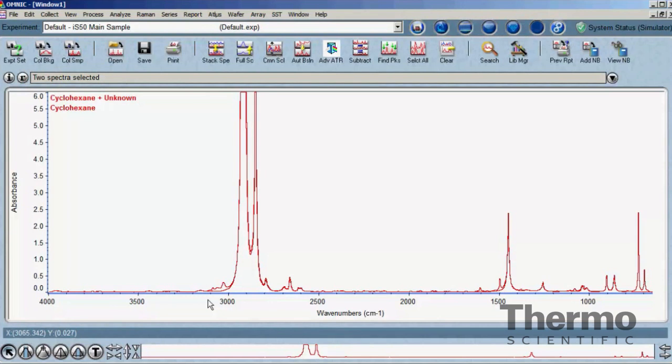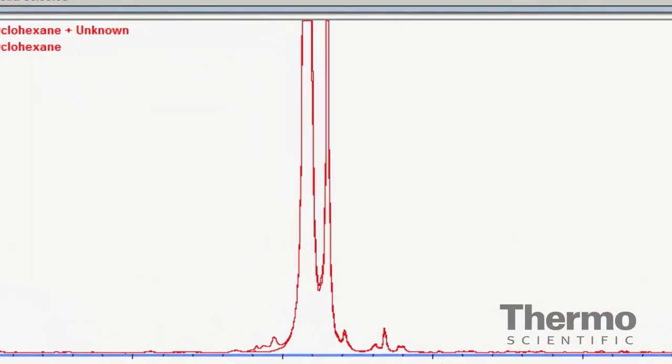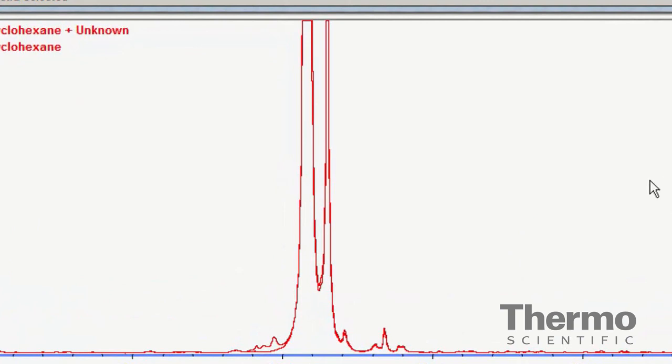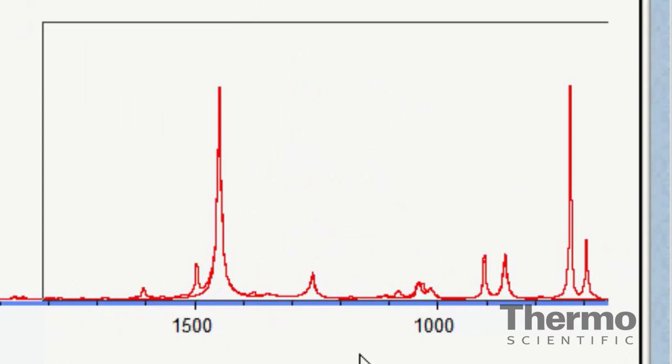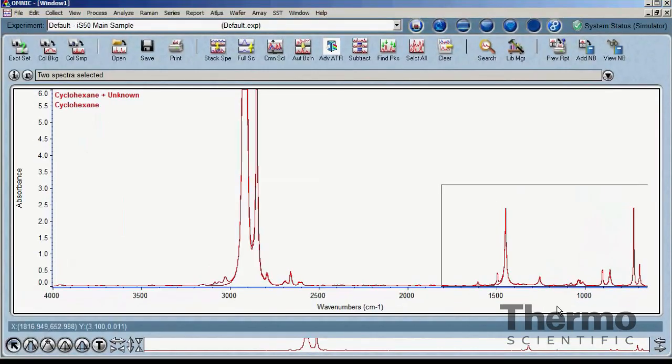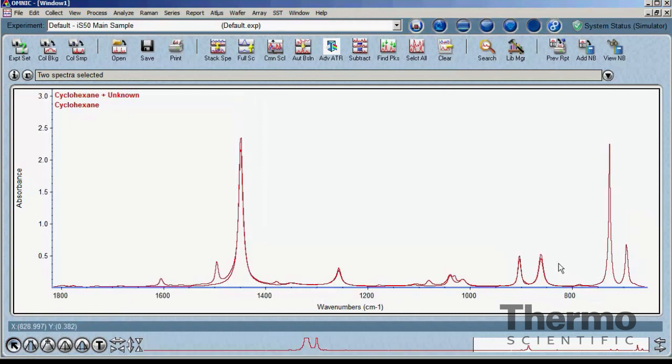Omnic will calculate a scale factor for the subtraction when this tool is called. By adjusting the display in the Omnic window to target an optimum spectral range, Omnic will make a better first guess at this factor. Try to avoid regions with off-scale peaks while looking for regions where differences can be observed. The scale factor is the number that is multiplied by the reference spectrum to change the intensity of all the peaks before the subtraction occurs. This will help if the spectrum was not collected with the same sample thickness or concentration as the mixture spectrum.